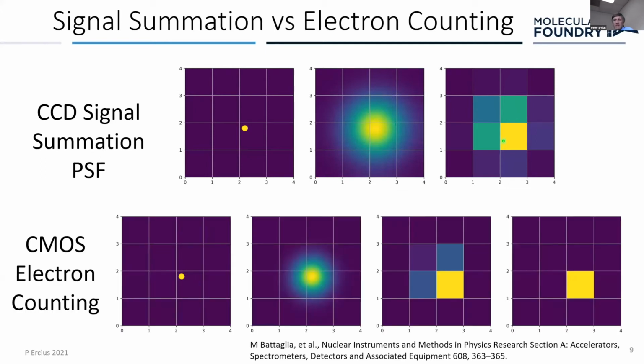But if we can run fast enough, we can see single electron events, so that we can localize those events. So if we can thin the detector, run super fast, and each one electron is imaged by itself, then you can actually see this charge cloud energy deposition, and we can reduce all of this energy to one pixel. We can put it back to where it actually came from. And so that means your detector noise is 0, basically, and you're just counting electrons as they come in.